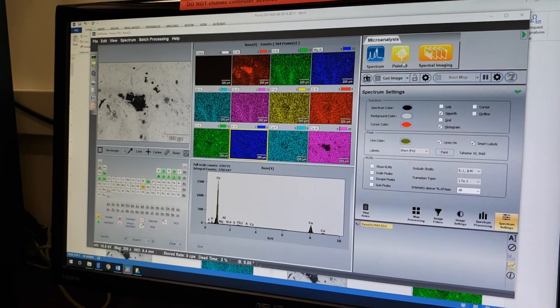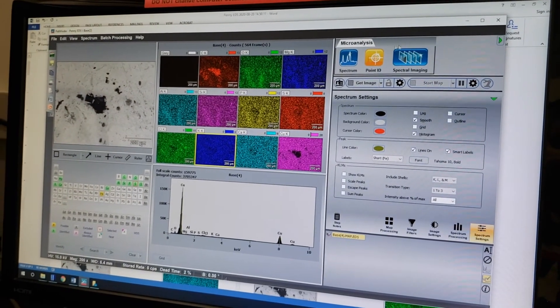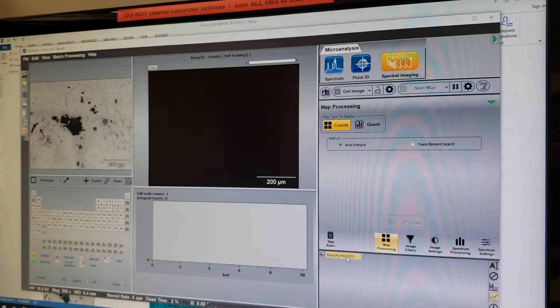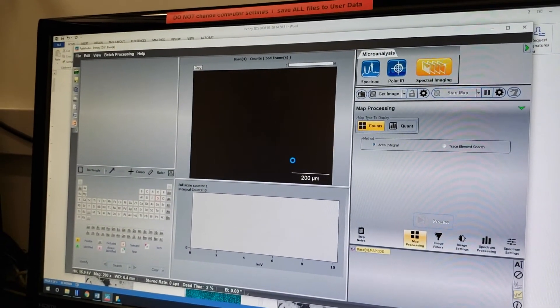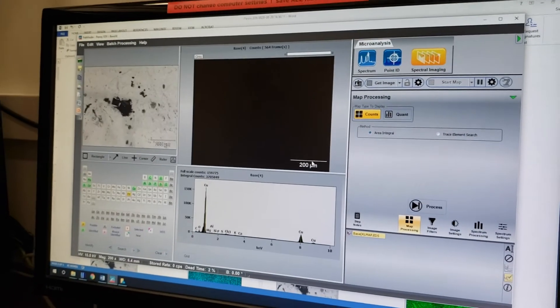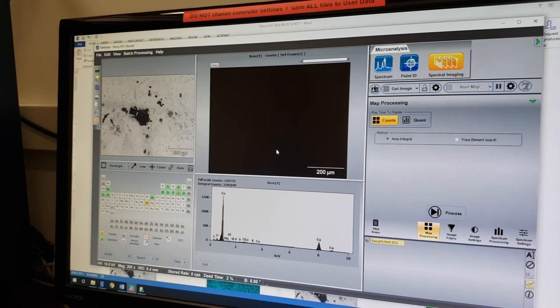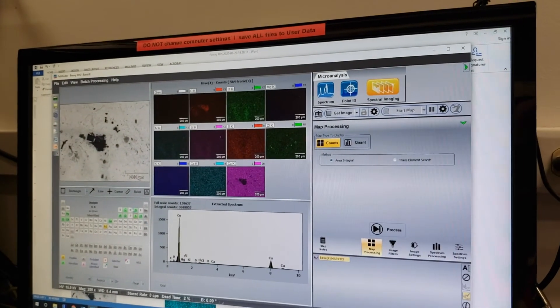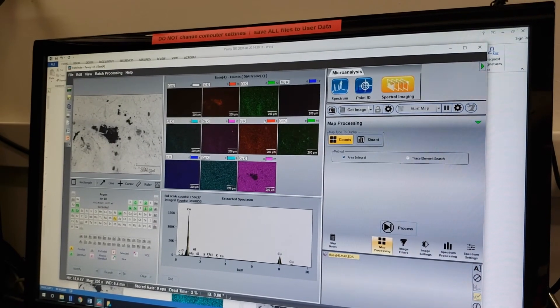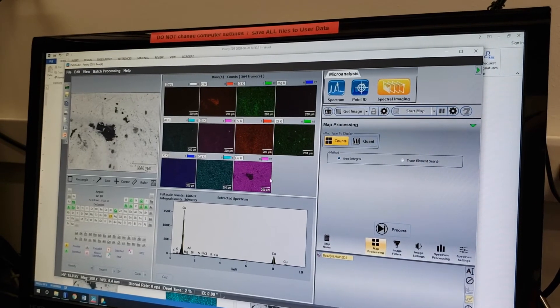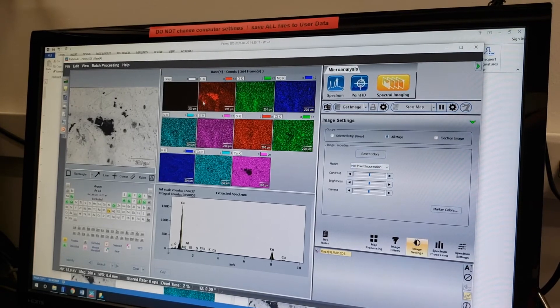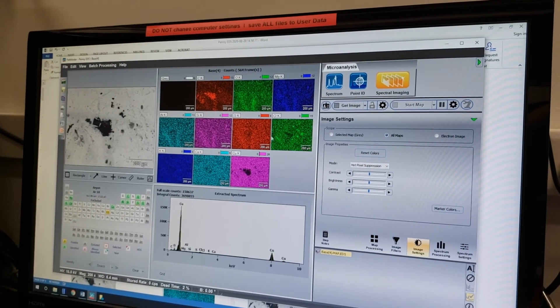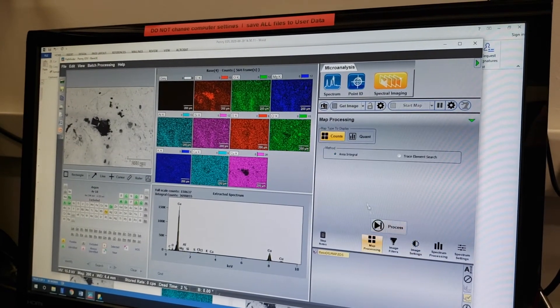When you get multiple maps or go to another screen and come back to mapping, you'll often find the colored maps have disappeared. This does not mean the data is lost — it just isn't showing them currently. Go to Map Processing, Process by Counts, and click Process. That brings all the data back. Note that your custom colors will be lost and hot pixel suppression will be reset, so you'll need to reapply those settings.